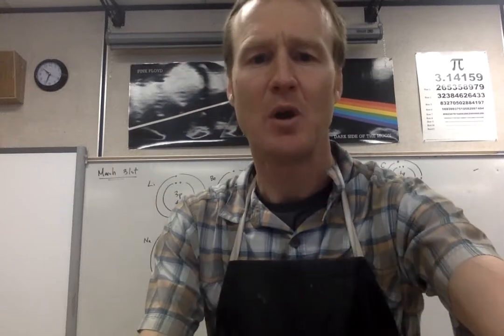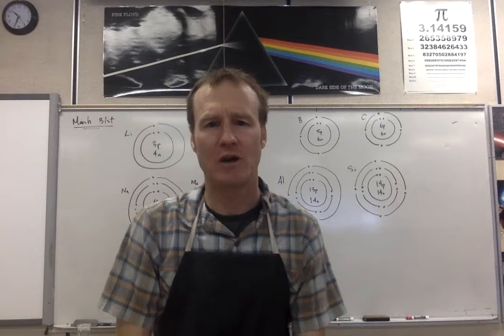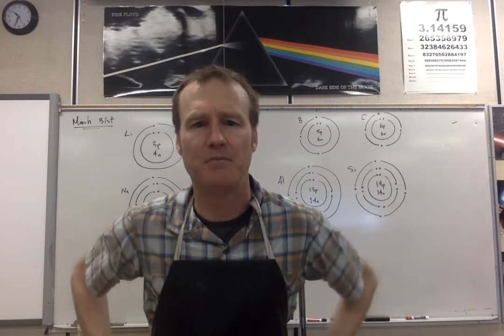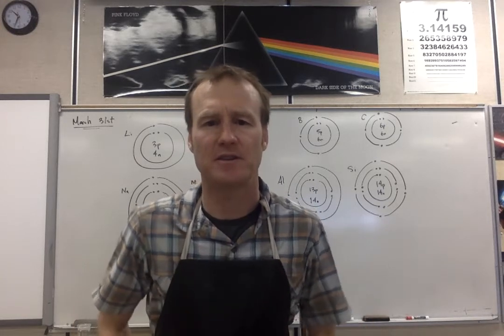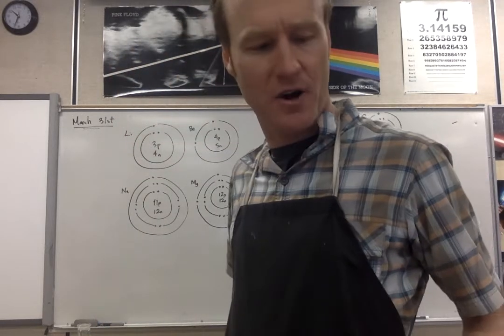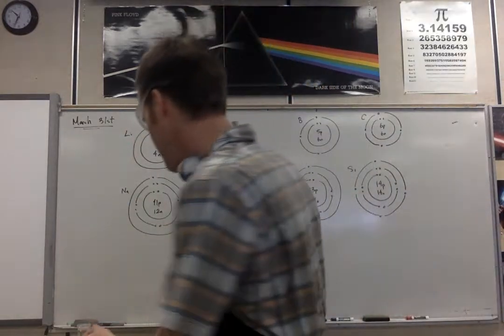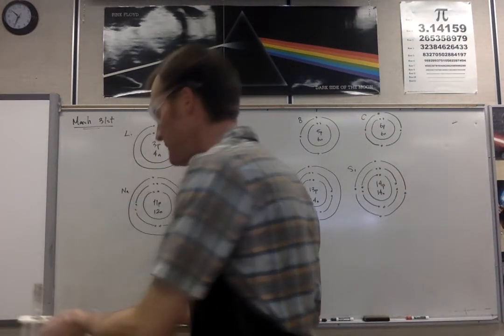We're going to look at the trends for how reactive these elements are with water, how reactive they are with acids for this lab activity. We're also going to look at what sodium does, but we're not going to do that here in the lab. We're going to go outside for that because of the safety risks associated with using sodium. So starting with where we're at here, I'm also going to demonstrate for you carbon.